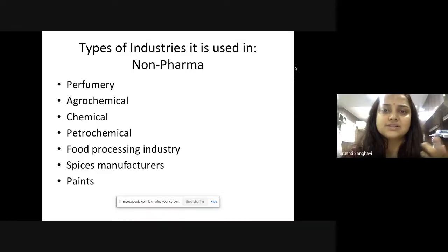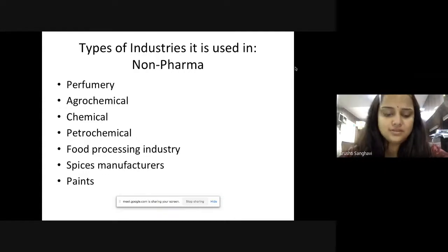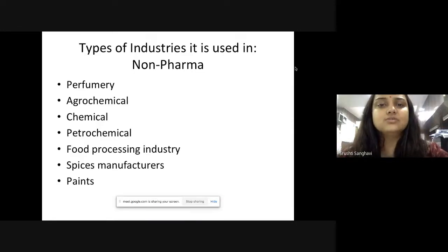The reason why these spices give out that aromatic flavor, you walk into the house and you smell pav bhaji if it is being made, is because of the volatile oils that are there in that masala. So clove oil: when clove is heated, the volatile component, the clove oil, gets into the air and you smell it and you realize, arre, pav bhaji is being cooked. So these exporters or manufacturers want to make sure that it's of a certain quality, and the way they check consistency in their manufacturing or in the export is using gas chromatography.